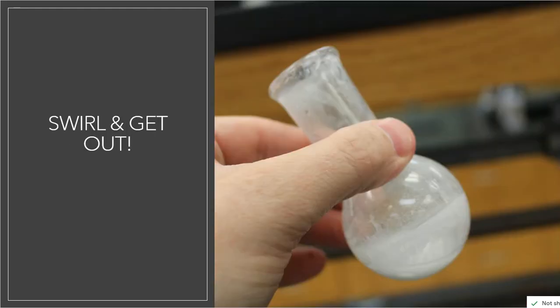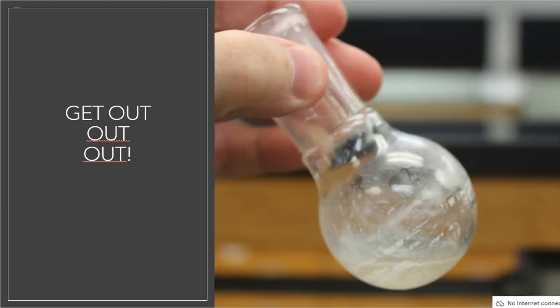So I added about 15 mLs of very cold water to this product, and I just gave it a really, really good swirl, and I poured that through the filter paper again. Well, I still had some residue left over, so I took another 15 milliliters of ice cold water, and I added it to that flask. I gave it another swirl, and then I poured it through as well.